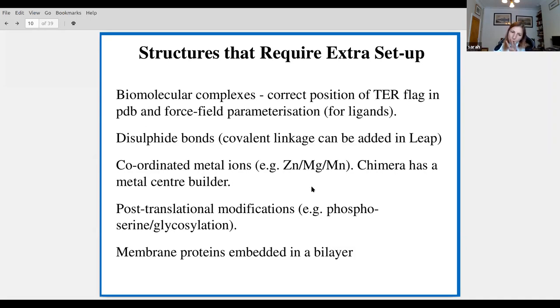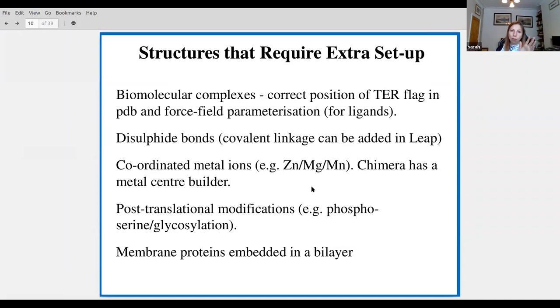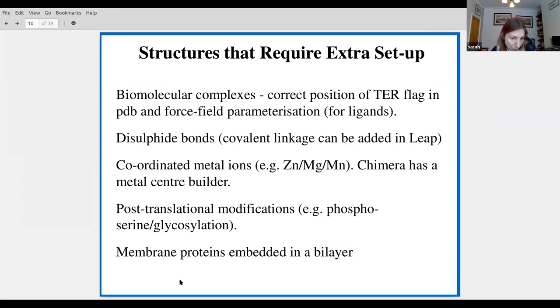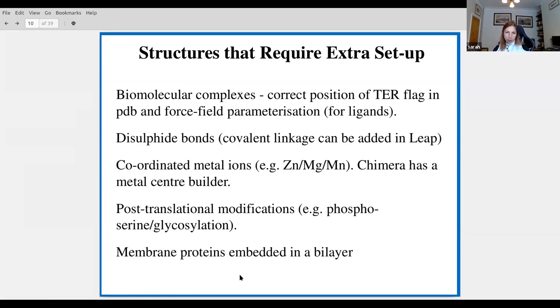If you've got phosphorylated amino acids, glycosylated amino acids, or any sort of post-translational modification, you'll need to think about that carefully too. Parameters for many PTM amino acids are available on Richard Bryce's website. And if you're running a simulation of a membrane protein, you'll need to make sure it's correctly embedded in a bilayer.